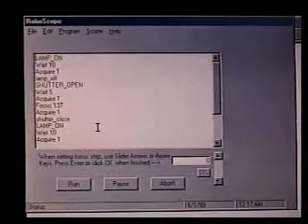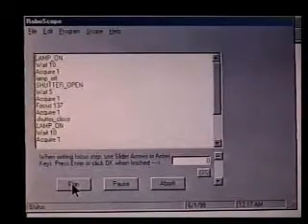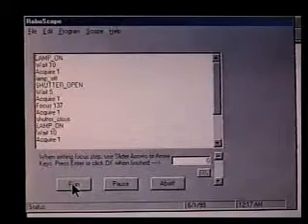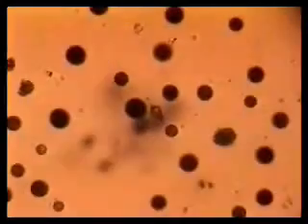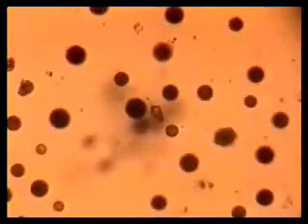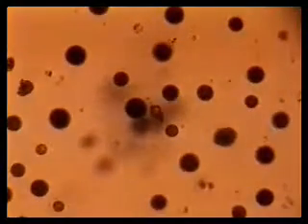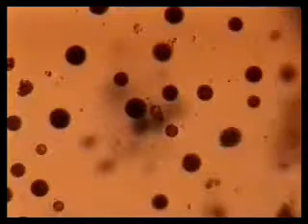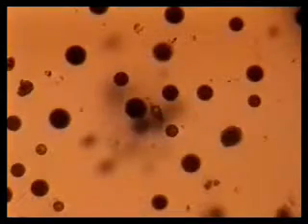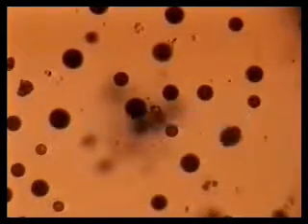And now we're ready to run the program. So, all you do is click Run. It starts by turning on the lamp, and it waits for ten seconds to give the lamp time to get to full illumination. Then it acquires an image, names it with the time.